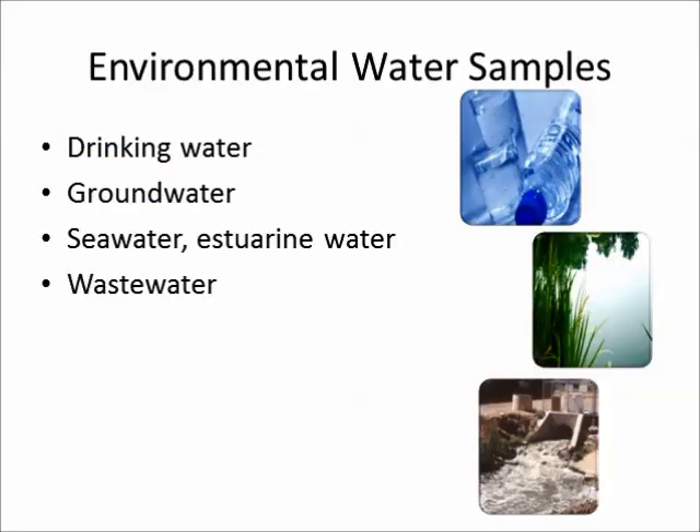In this video, you will see 1 liter water samples, representative of the types of samples encountered in the environment, extracted for pesticide analysis using a method such as US EPA 608.